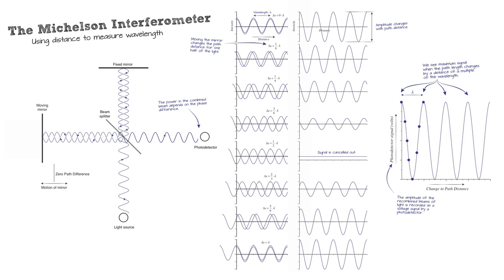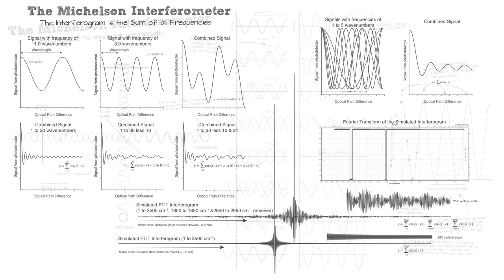Have some fun. Add up some waves. Add up their power. See what it comes to. See if you agree with this graph. And if you don't agree, come see me or talk about it on the class forum, and I'll tell you why this graph is right. All right. So that's the notes on the Michelson interferometer.